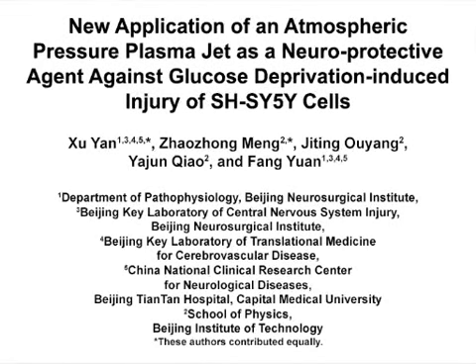The overall goal of this treatment method is to provide a detailed in vitro treatment protocol for neuroprotective applications of helium atmospheric pressure plasma jets on glucose deprivation-induced injury in SH-SY5Y cells.